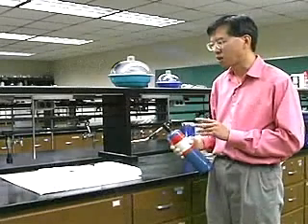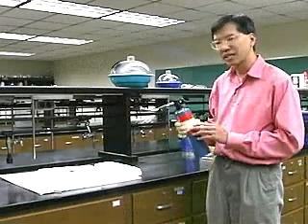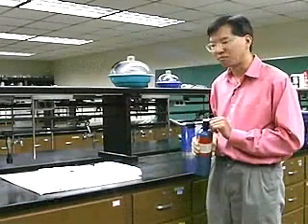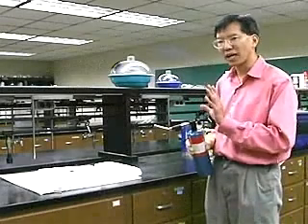I'm going to demonstrate that redox reaction right here. What I have is a block of dry ice with a pile of magnesium shavings on the inside. And I'm going to take this torch and I'm going to ignite the magnesium. What you're going to see at first is the magnesium burning in air, and it'll burn white hot.